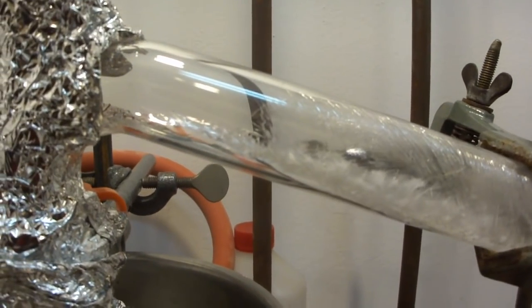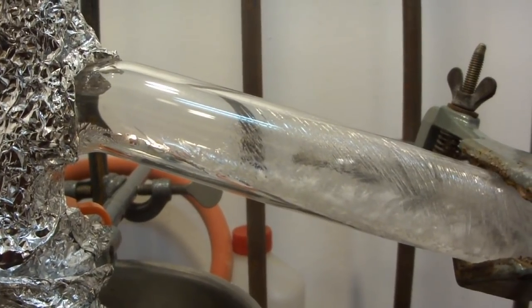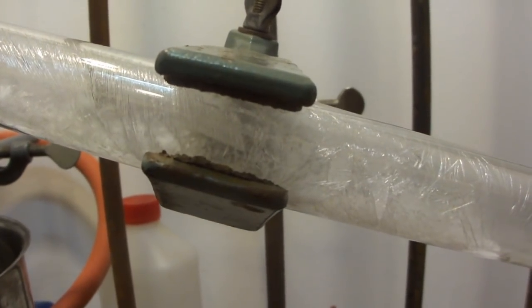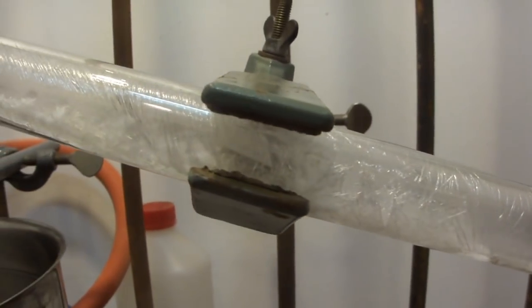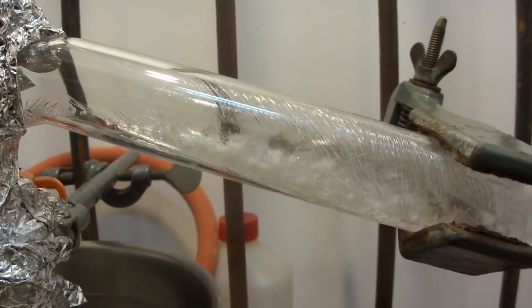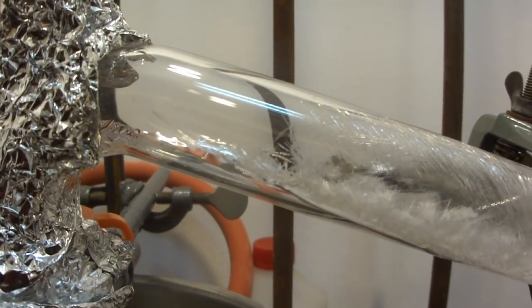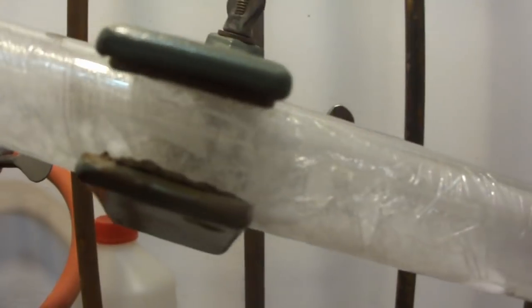So you can see how the trioxane is nicely depositing in the distillation bridge. And I find it so super satisfying that I'm really hesitant to use the heat gun to melt it down, because these crystals look just gorgeous. So excuse me if I include like 10 minutes of footage just from these crystals, because they are so nice.